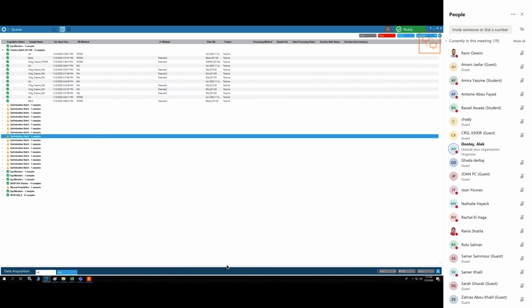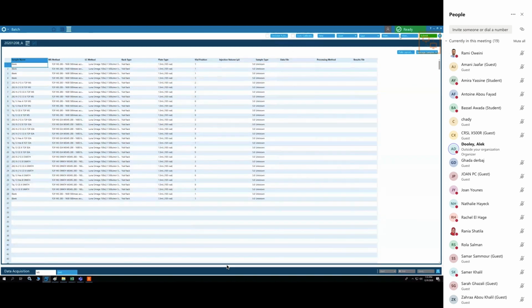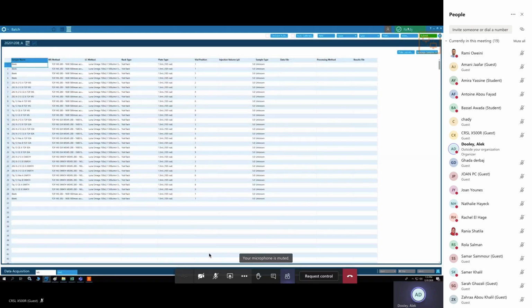So this is not a permanent record. That's also another reason why I like to save my batches. Then I know I have my work I've done for years, and I can go back and see, oh yeah, on this day I did that. But it's not necessary to save. You can click submit directly. All right, great.